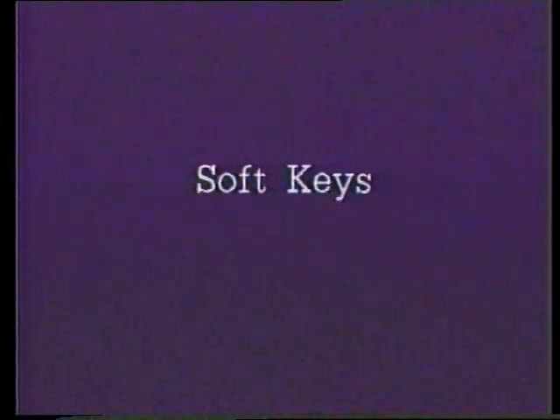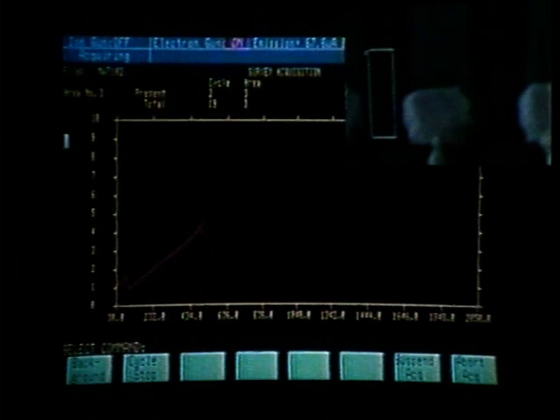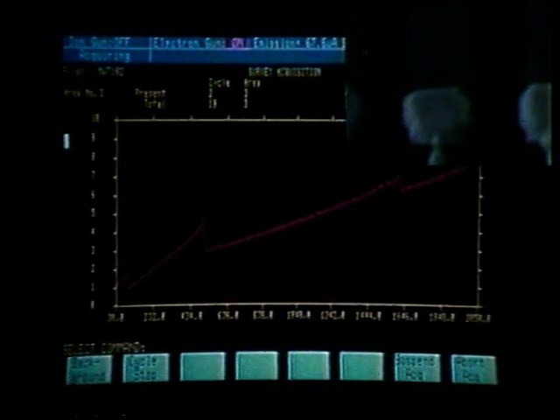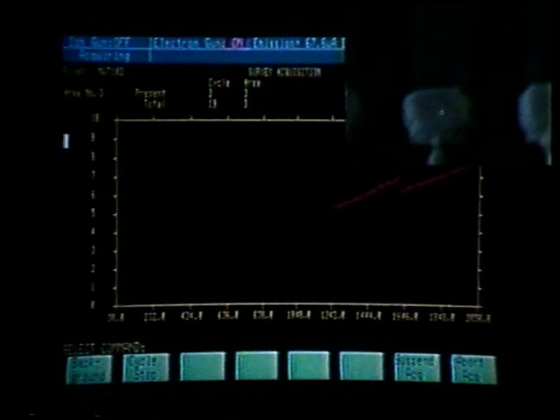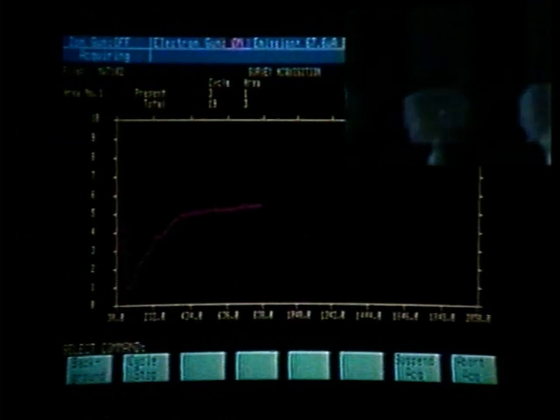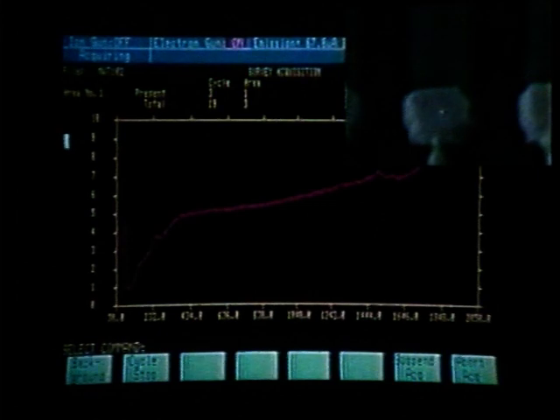The soft keys available during acquisition: soft key number 1 allows us to go into the background and manipulate any data on the data disk. Soft key number 2 — cycle stop — would stop at the end of the current cycle, after looking at areas one, two, and three, since the three areas constitute one cycle. Soft key number 7, labeled suspend acquisition, would momentarily stop the acquisition so we could re-register on the TV image and then return to acquisition. Soft key number 8 would interrupt and completely abort the acquisition.